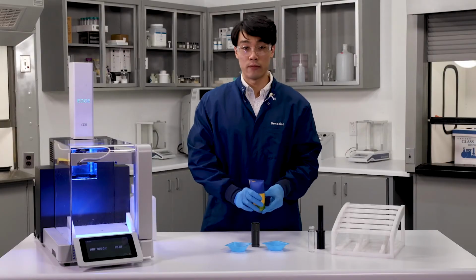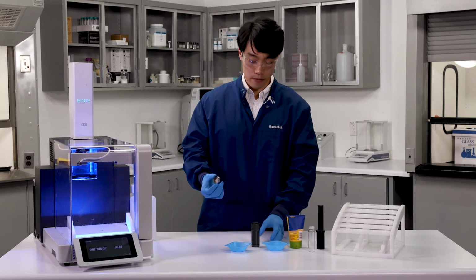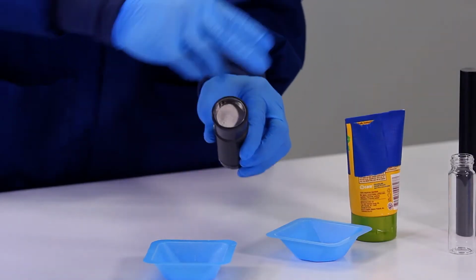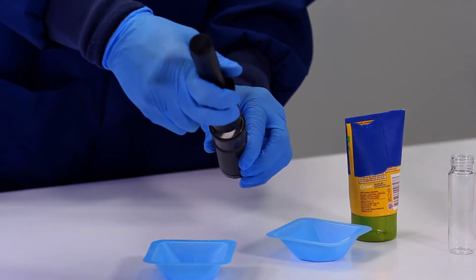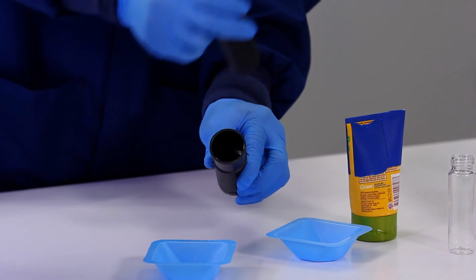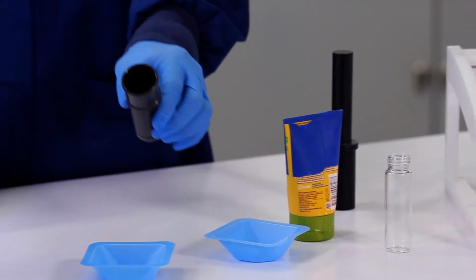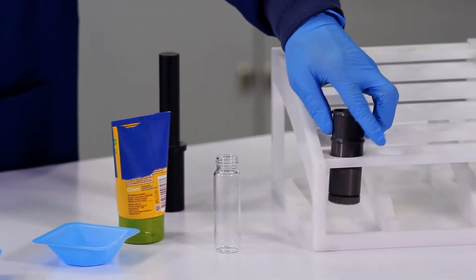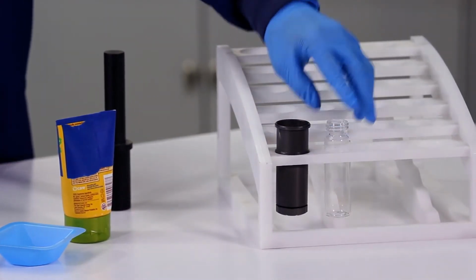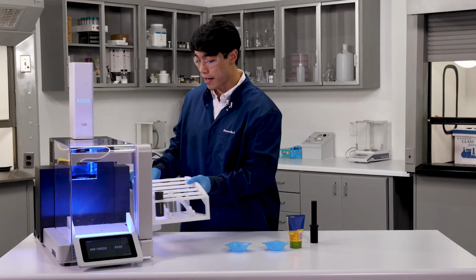And now that we have our sample fully prepared, we'll go ahead and take our Q screen, insert it into the top, and then press down with the tool. And once that's inside the Q cup, we'll go ahead and load the cell into the rack, place an extraction vial beside it, and I'll go ahead and place the whole rack inside the Edge.